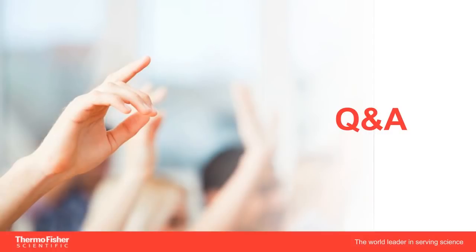Thank you. Our next question is, which gel would you choose, precasted gels or manually made gels?